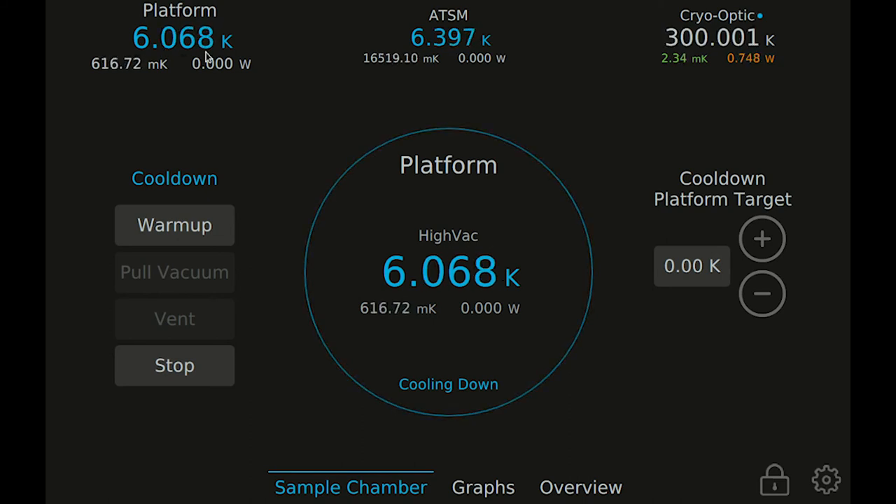Back on the platform operate view, you can press stop or warm up at any time during the cool-down. To warm up as quickly as possible, use the warm up button to actively warm the system using the heaters on stage 1, stage 2, and the platform. The vacuum space will be left valved off at the end of the warm up process to keep your sample chamber vacuum space as clean as possible. Pressing stop will turn off the cryo cooler and allow the system to warm up naturally, leaving the vacuum space valved off.